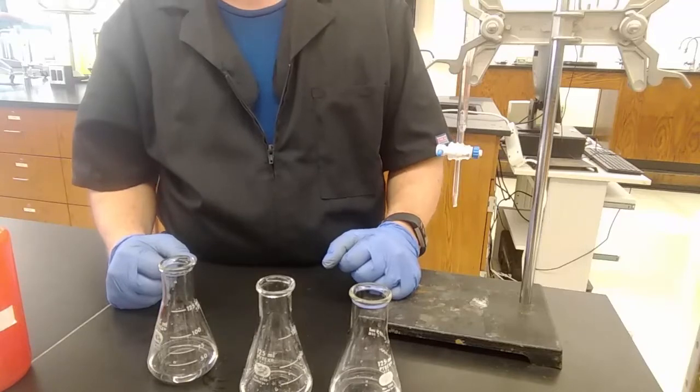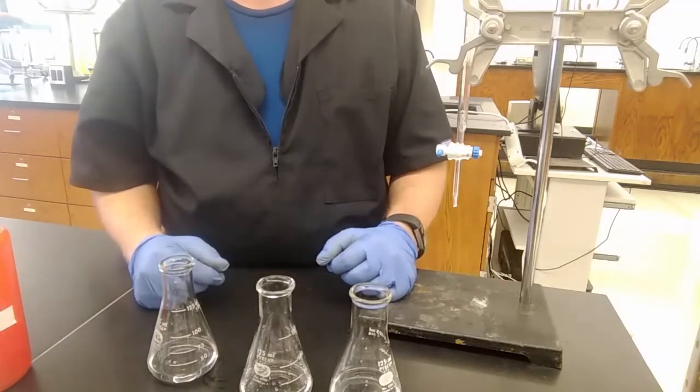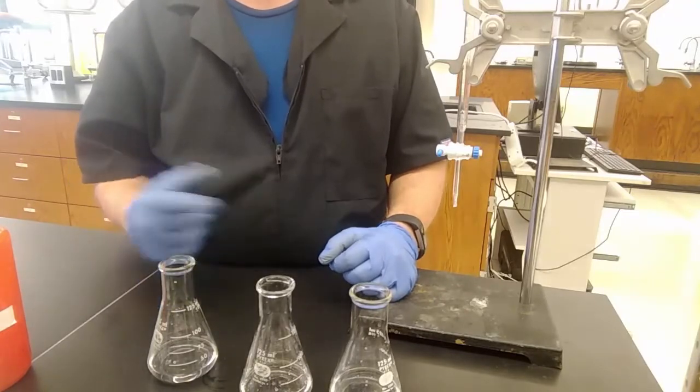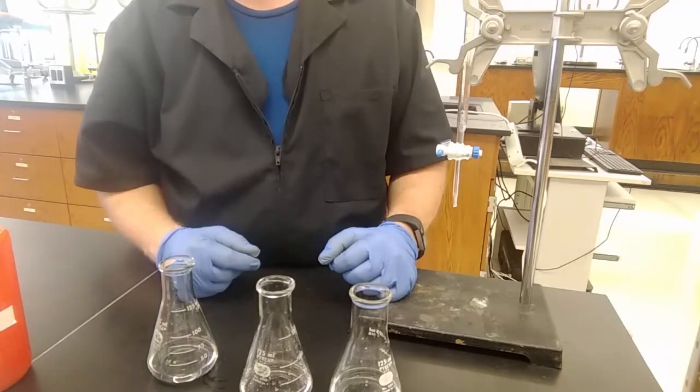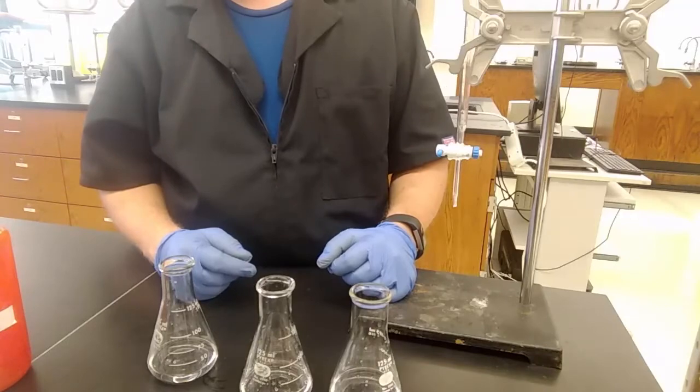Why do you not add more than 2 or 3 drops of indicator? Because it's an acid. That's how it changes color. When its H plus comes off of it as an acid, that's when it changes color. So if you add a whole bunch of extra indicator, you end up with a whole bunch of extra acid, and that messes with your reaction.